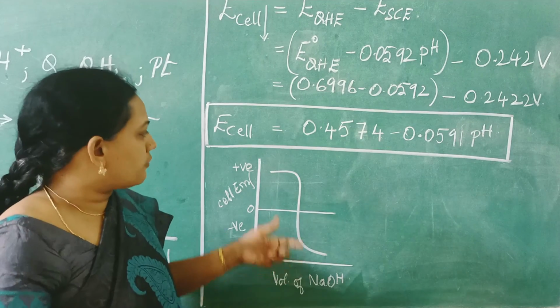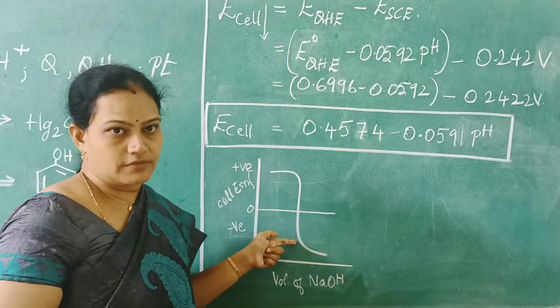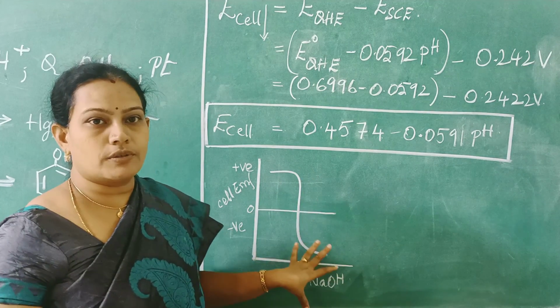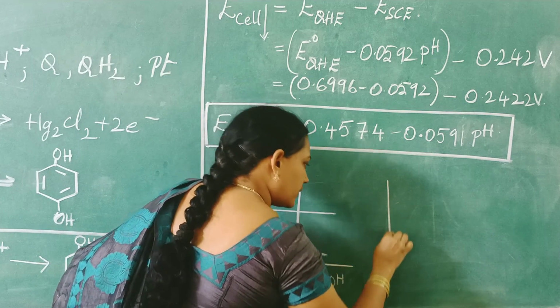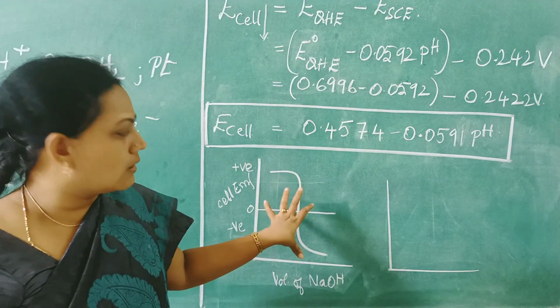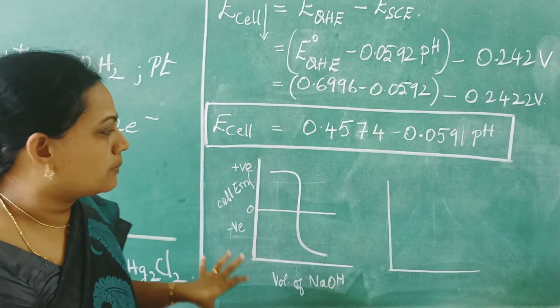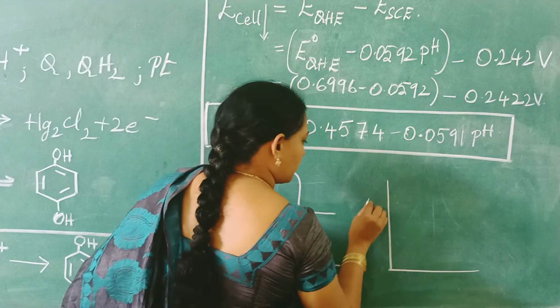So this particular fall of the potentials from positive to negative will indicate the completion of the reaction. So this is how we are able to read out the endpoint of the reaction. Now apart from this particular titration, to have a close watch on where exactly the endpoint is occurring, we again do the whole titration plotting the differential graph.